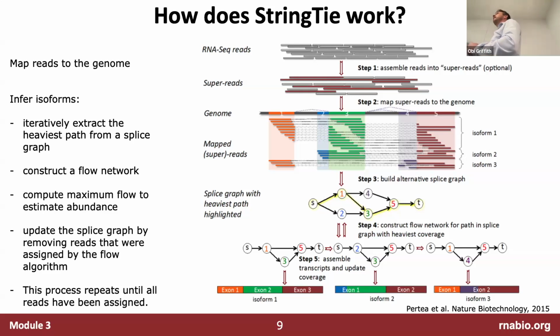It's trying to figure out not only how expressed this gene is at the locus level, but which specific isoforms are being expressed and at what levels. Is all of the expression output from this gene one specific isoform? Is it a mix of these two isoforms? Is it spread across 3 isoforms? Does that change between different conditions?